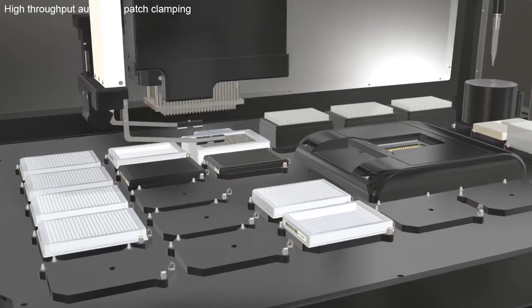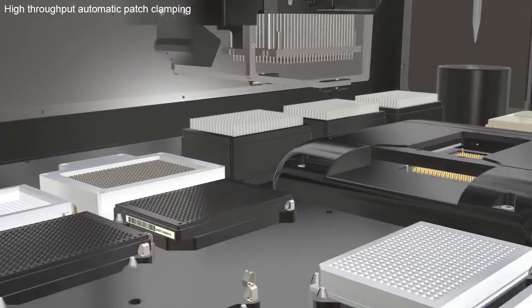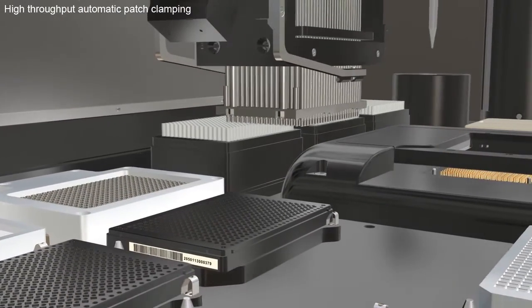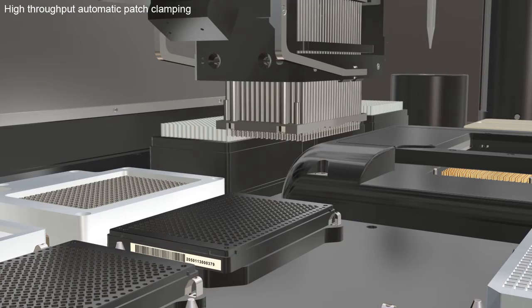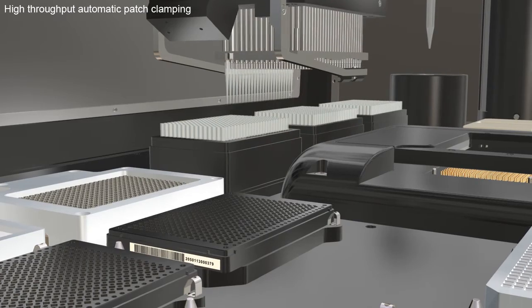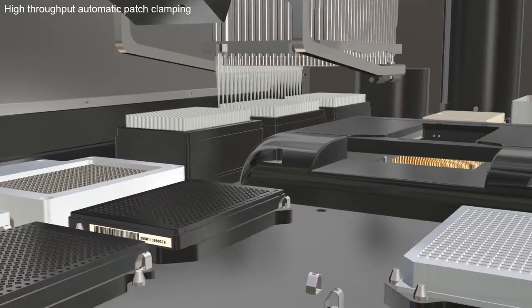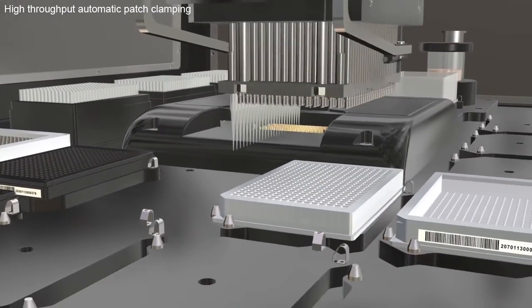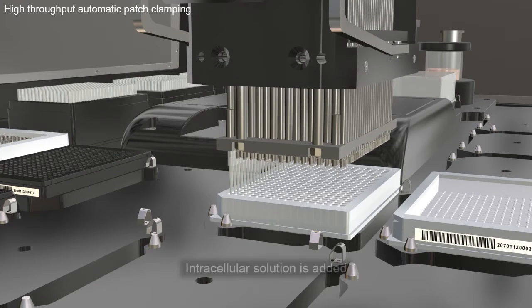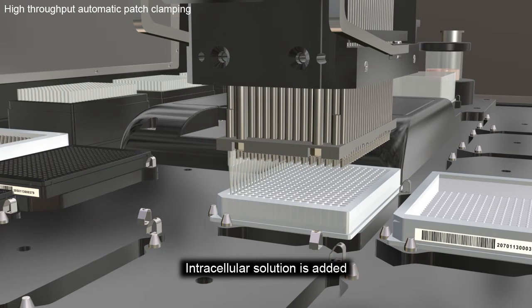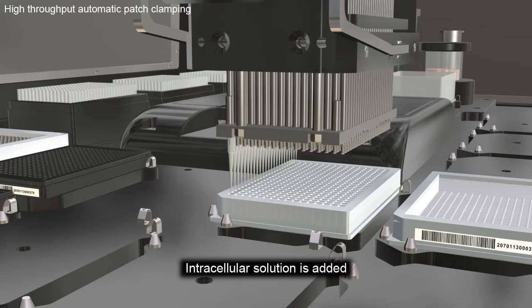The pipetter continues with priming the Q-Chip. The pipetter aspirates intracellular solution and dispenses it into the Q-Chip.